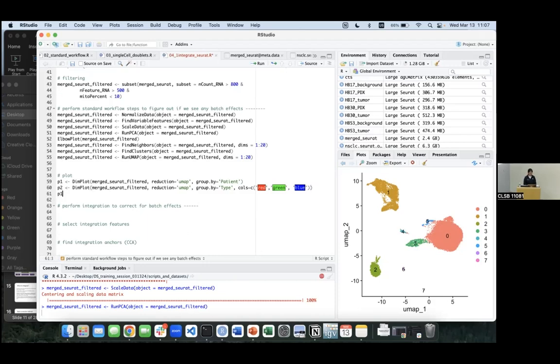And this is what I learned like 2 days ago. You can literally just do a straight line here that's gonna have you have the plot side by side. Yeah, I didn't know that in R, so okay, and still running.